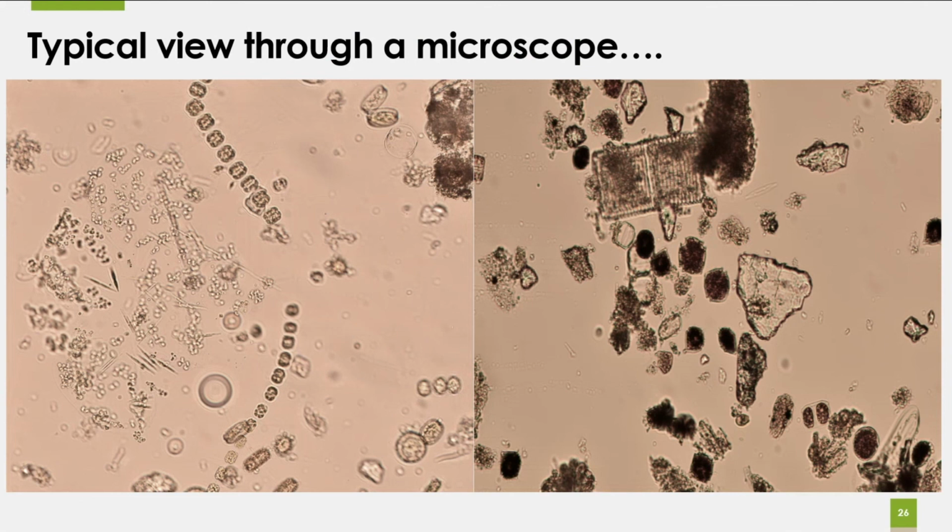This is a typical view through a microscope. These could be Alexandrium. I just noticed that recently. But sometimes it looks like that. And this is an instance of when you would want to look at a diluted sample, or in this case, I probably would just look at a 2-liter sample concentrated to 15 ml as opposed to anything being diluted. But again, I'd give you the option. I'd give you multiple samples to look at, or I'd give you just a diluted sample to look at. So I'm thinking we're just going to be giving you samples that are countable and high. Yeah.